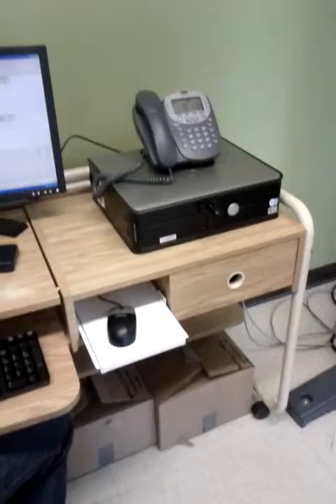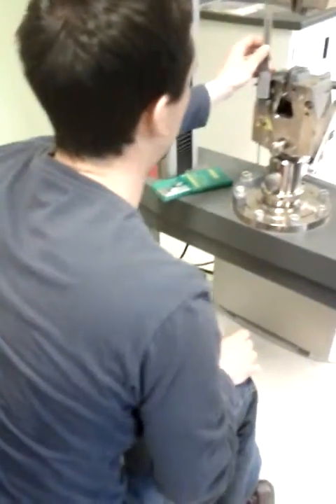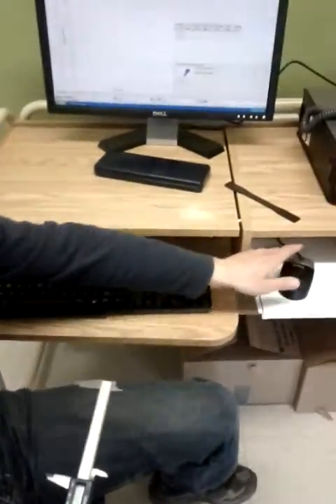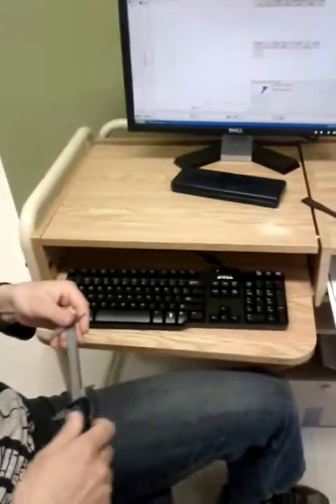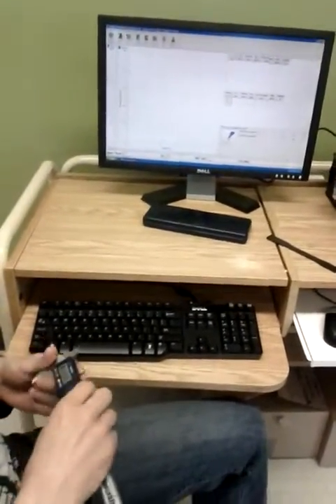I should have 115 here. This is good. So after each test, I click LE to go back to the starting position.